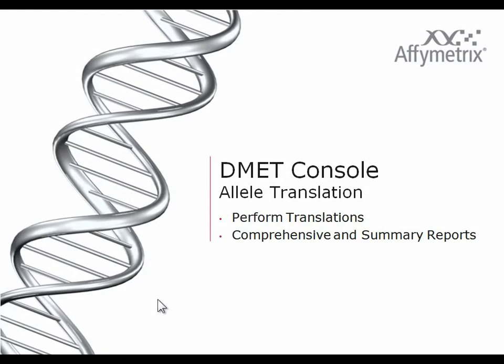This section on DMET Console software is about allele translation with a focus on performing translations and the content of the comprehensive and summary reports.